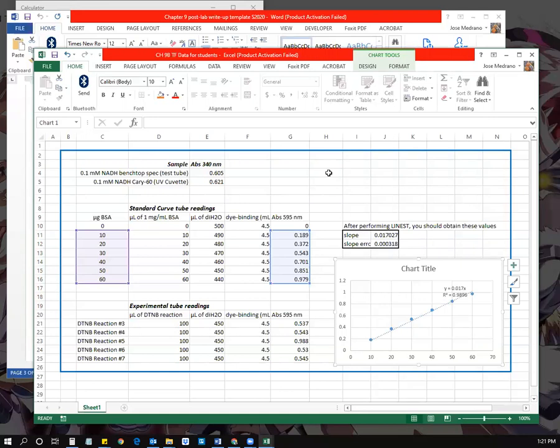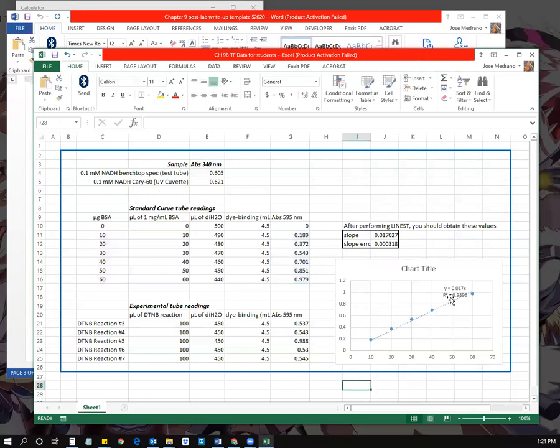And so if you know, you can follow along, great. If not, no worries, because I've also included that pertinent data here in the TF data. But if you want to do it on your own, just basically follow along for the next 2 minutes. So what we need to do is find this LINEST function, which is going to give us and report to us the slope and also the error in our slope so that we can start propagating some error in our next calculations.